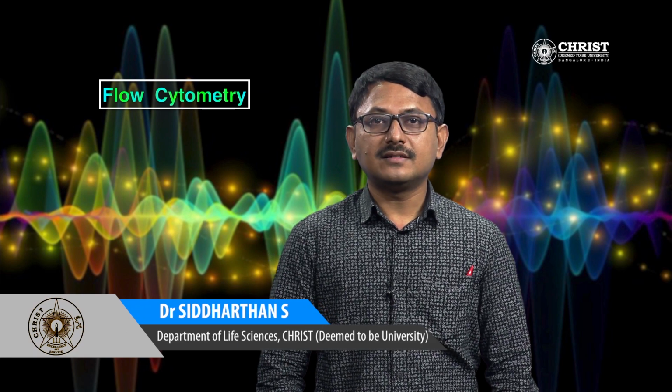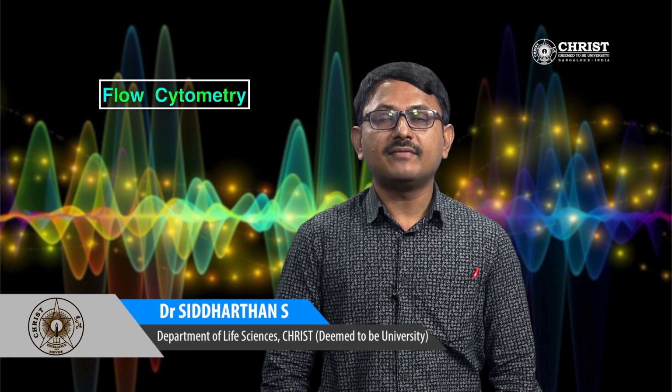Hello students, in today's session let's learn about flow cytometry, one of the most advanced imaging techniques with a great deal of applications in biology. Flow cytometry is an analytical technique that's used to analyze the physical and chemical characteristics of particles in a fluid as it passes through a laser beam. The cell components are fluorescently labeled and then injected into the flow cytometer. The fluorescent particles are excited by a laser to emit light at varying wavelengths.